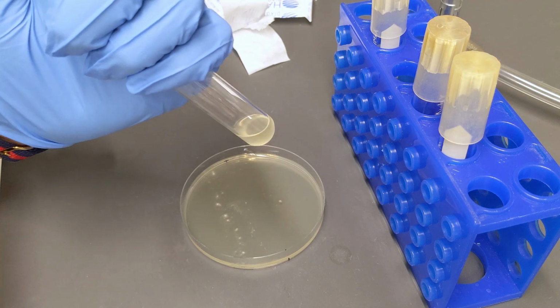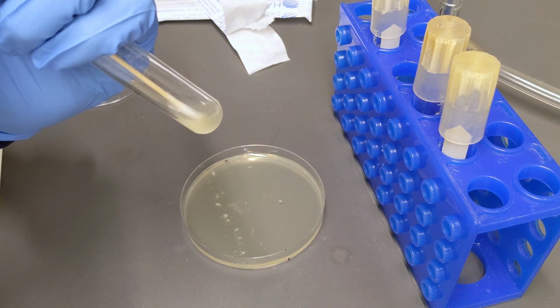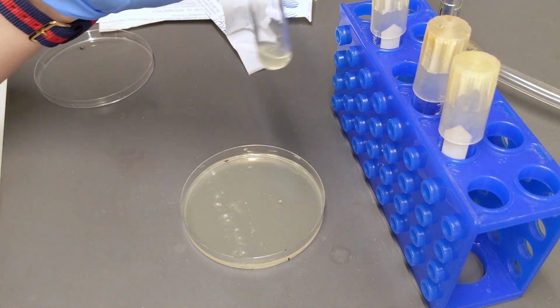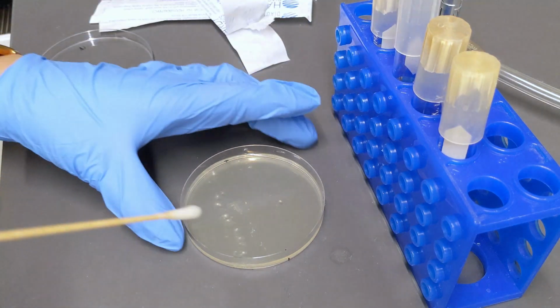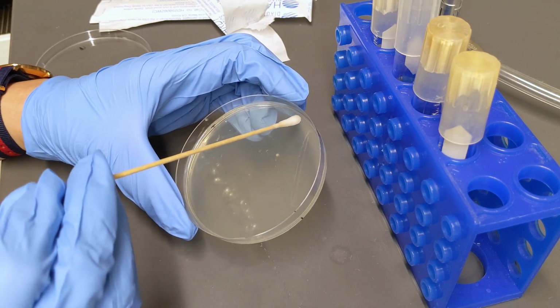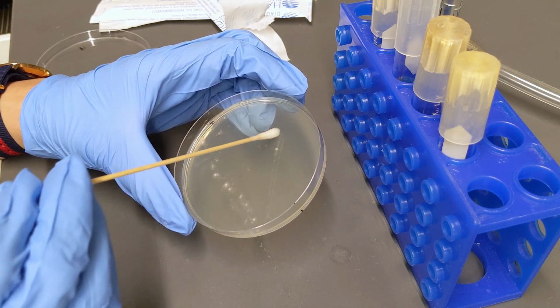Similarly, we inoculate S. aureus ATCC 25923, S. aureus RN4220, and S. aureus A325 to different areas on the agar plate.